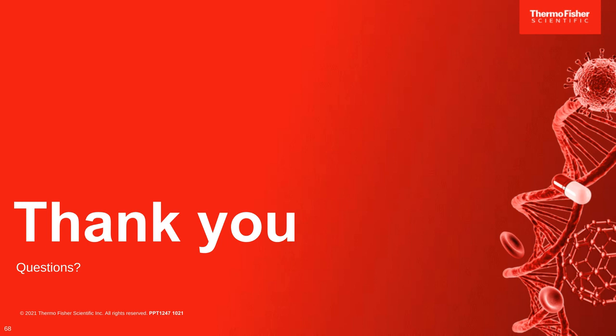If you're doing any type of DNA extraction and you're using our kits, you would be familiar already with the software and how it all works in loading the plates. So if you move to a protein isolation, the only thing you need to do is select the right type of bead. Ketil talked about some immunoprecipitation protocols and the beads that we'd be using for that. The really nice thing is if it's the Thermo Fisher bead set, there should be some protocols already written for the Kingfisher. Depending on the instrument that you have, the Flex or the Duo Prime, you can just download them from the website and then start using them straight away.